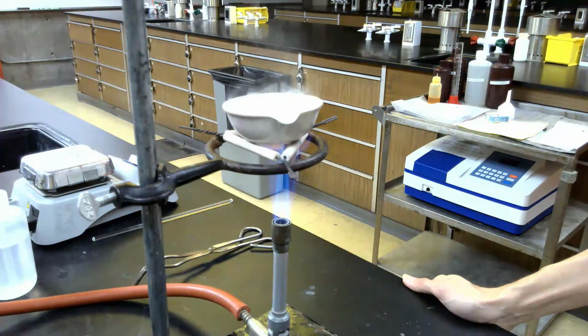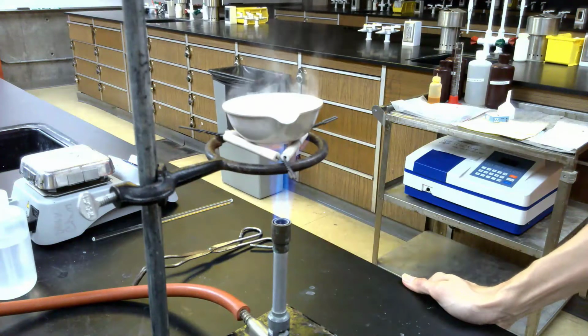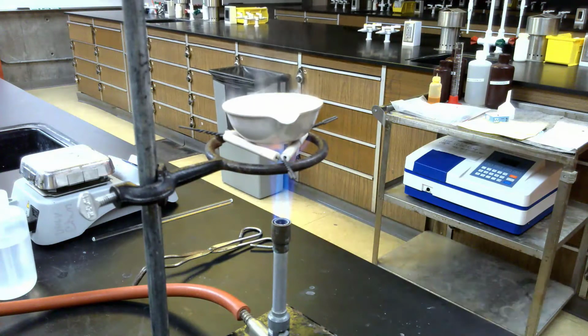And after I do that, I'm going to let the evaporating dish cool for several minutes. If I take a hot evaporating dish and place it on a balance, not only do you risk burning yourself, but it can distort your measurements. When the heat interacts with the surface of the balance, bad things can happen, so we try to minimize that. So I'm going to let it cool. It takes several minutes to cool. You won't be forced to watch all that. And then we'll weigh what's left in the evaporating dish.